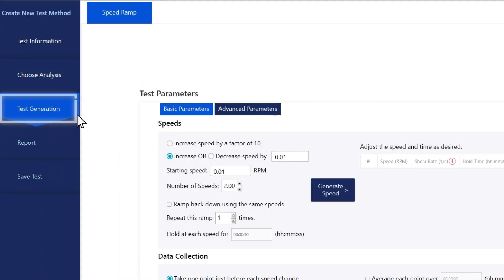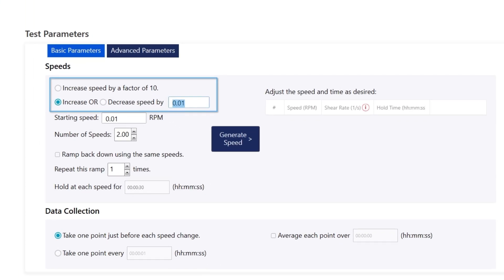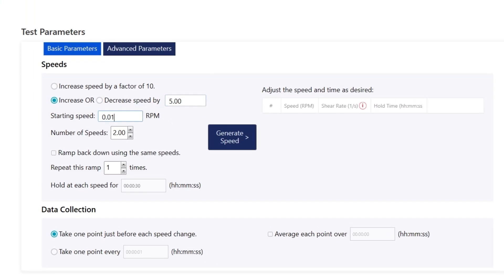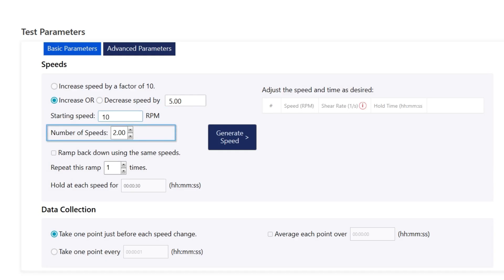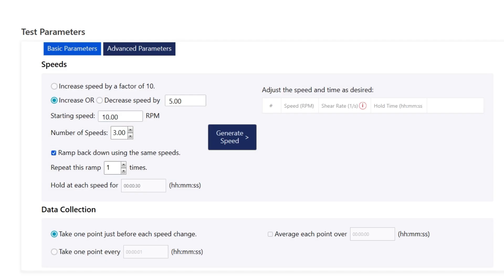In the test generation section, we'll increase the speed by 5 RPM each step, start at 10 RPM, and use three steps. We'll have it ramped down with the same steps once and have it hold at each step for 30 seconds.